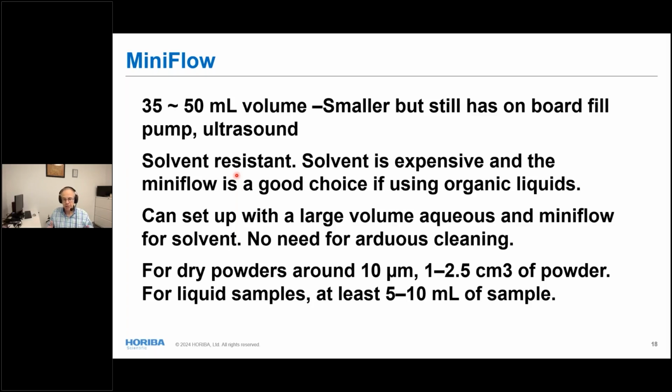You would use a smaller volume system for organics because organic liquids tend to be more expensive. So that's a second feature of having this. It's a bit like having a second instrument, and you dedicate one instrument to one application, another instrument to another application. And of course, in truth, it's the same optical bench, so there is a savings there.